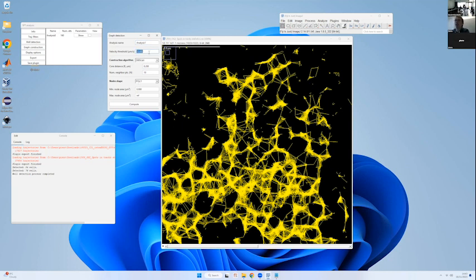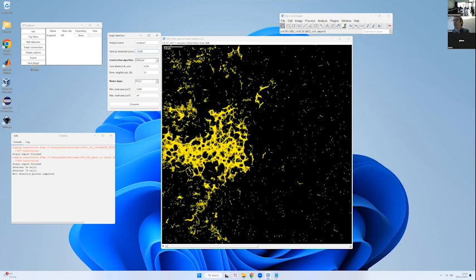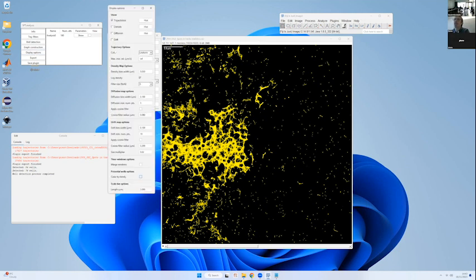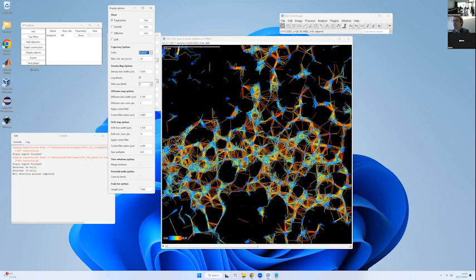Determining this velocity threshold is very important because it will really be a main parameter of the method. So to determine what you should put here, a good thing is to go to the display options and color code your trajectory by instantaneous velocity. Now you can see what David told you earlier. You have this blue region separated by orange and red.